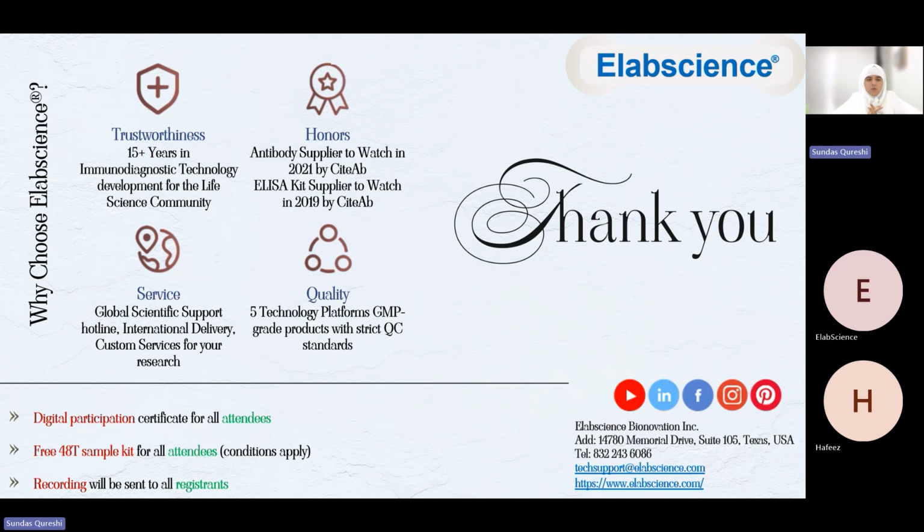Okay, here we have another question. How sensitive are TOS and TAS assays to small biological changes, such as early stage stress or mild interventions?